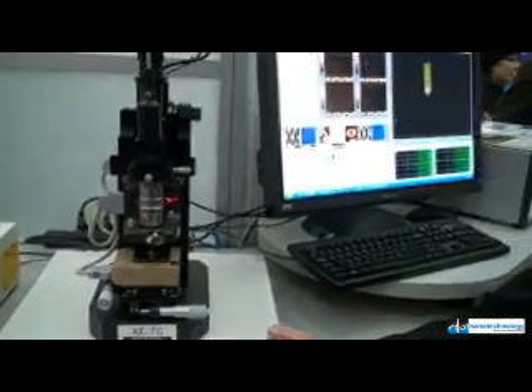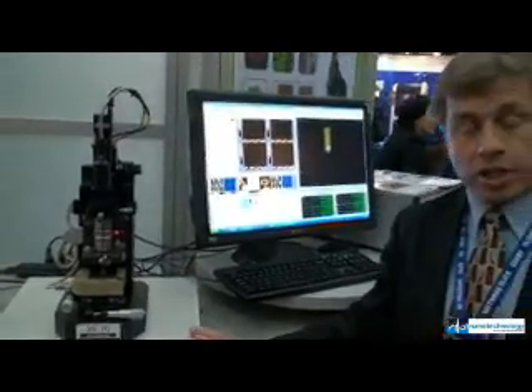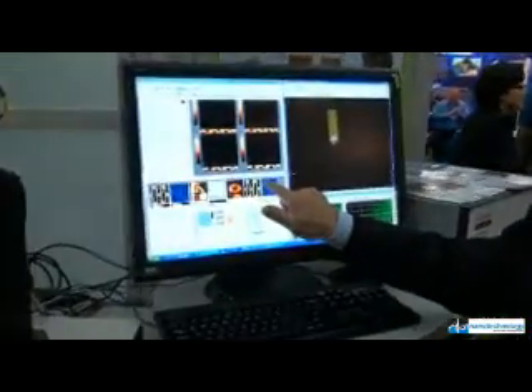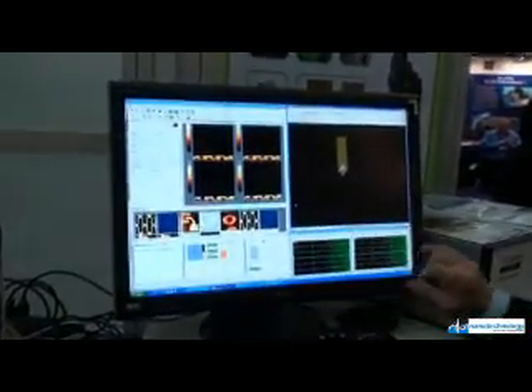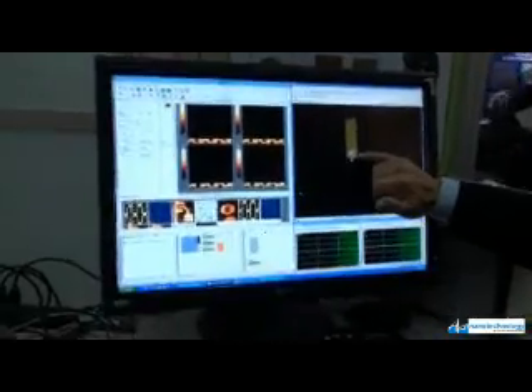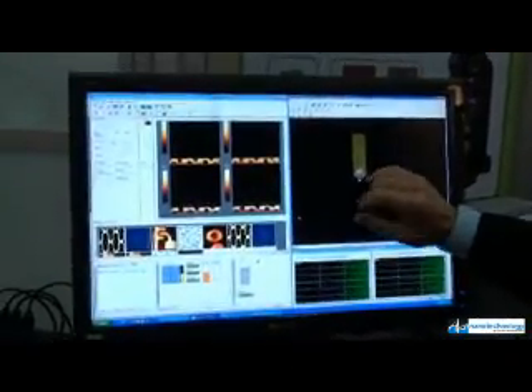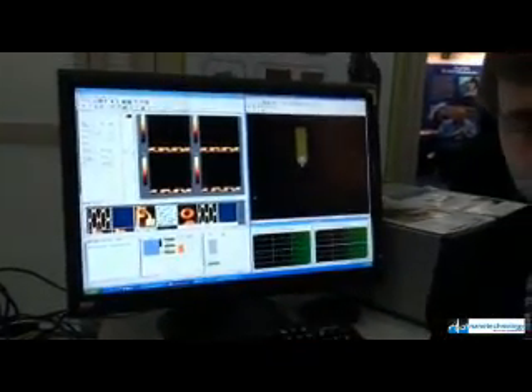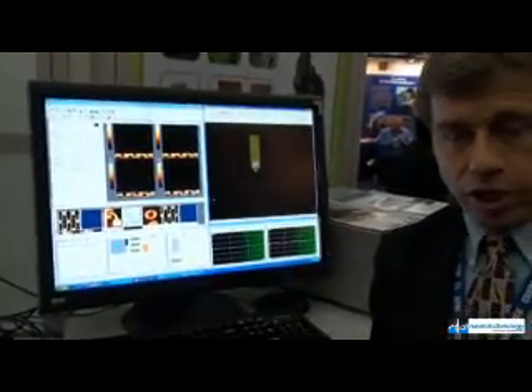This instrument has the ability to resolve down to tens of nanometers of resolution. If you see the screen to my right, you can see an image that's being created by a tip that resides on the base, on the backside of this cantilever, which itself is very small. The tip size is on the order of 5 to 20 nanometers — very, very tiny.